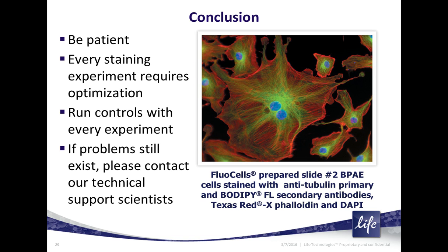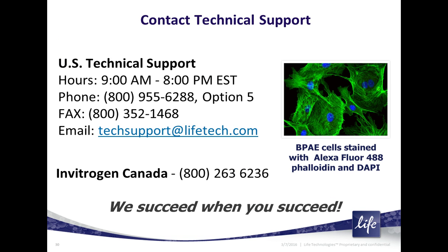I also want to say just real quick that you want to optimize your imaging system, your microscope, not just for the correct filter, but make sure everything is aligned, that the illumination source is correctly aligned, that the background is made uniform through the software, and that the condensers are aligned. Talk to your scope facilitator about the hardware issues, and make sure you're familiar with using your software, of course. Of course, wherever you buy your primary or secondary from, feel free to contact your tech support.